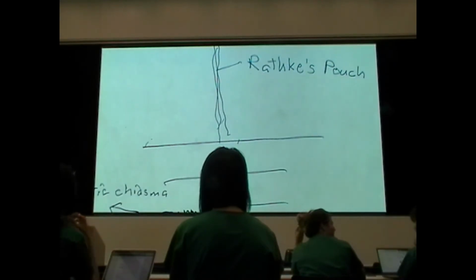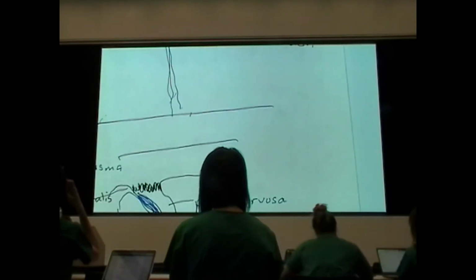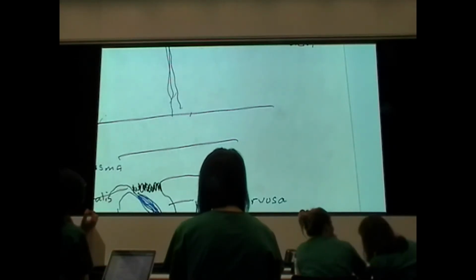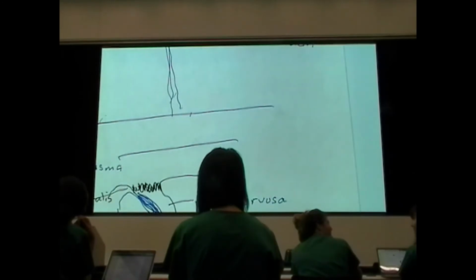Okay, so again, if we look at the pars anterior, it consists of clusters of chromophils and chromophobes with a lot of blood vessels in between. If we now move over to the pars intermedia, that is really still a remnant of Rathke's pouch. You remember the Rathke's pouch had a tubular connection to the outside.